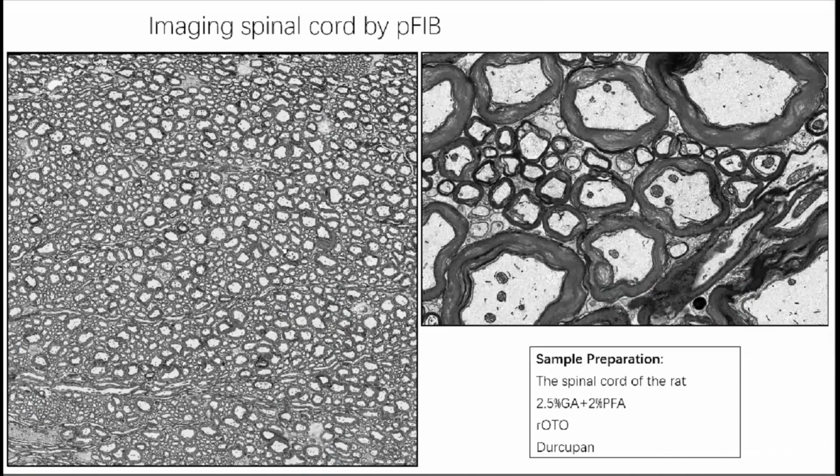This slide shows the data collected by PFIB. The area is 160 by 160 micrometers. I think both of the machines are as good as each other.